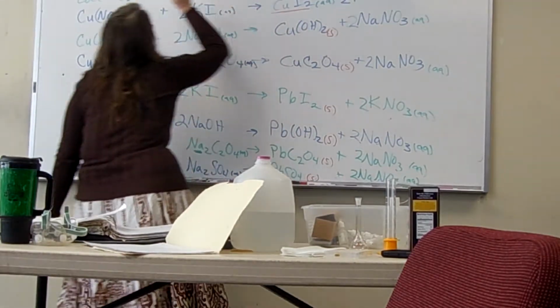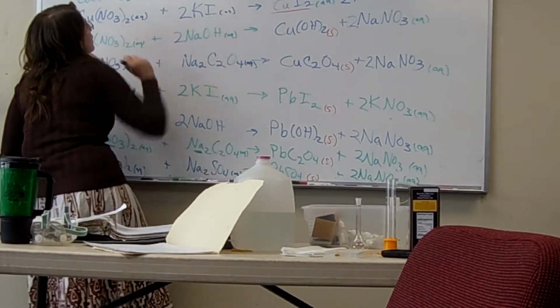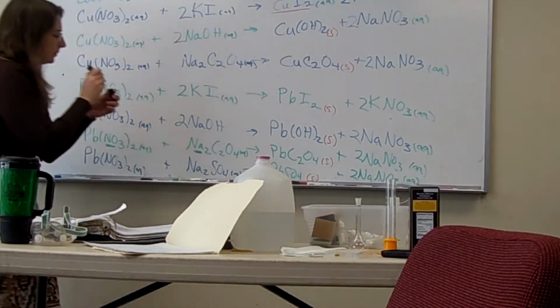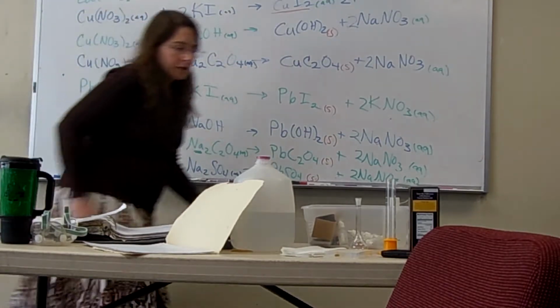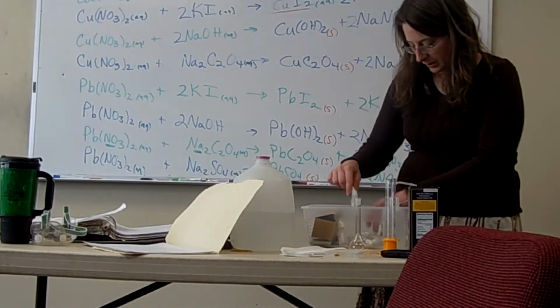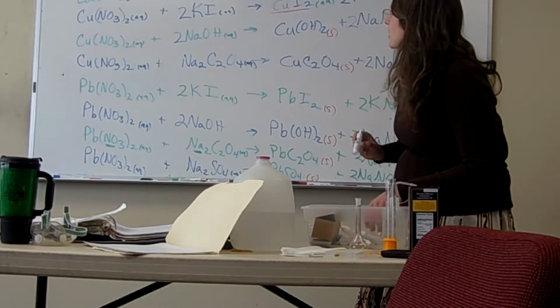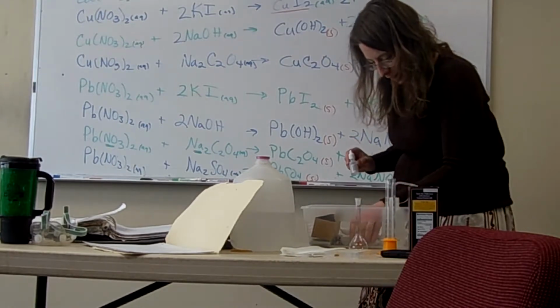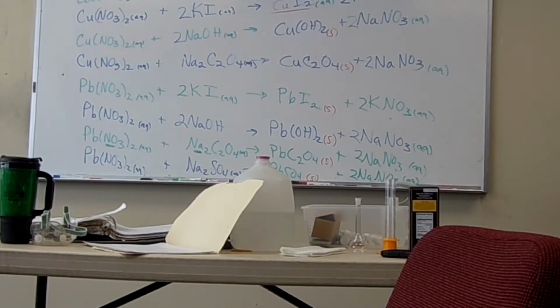And if we balance that, did you say it was zinc 2 nitrate? It is. Zinc is always a 2. Is it balanced? Yes. Okay. So if we do zinc nitrate, this lead nitrate, that wouldn't work. Zinc nitrate and potassium iodide. And we don't get a contaminated well by some chance. Yeah, you put your goggles back on. Even though these guys are pretty safe, always wear them.